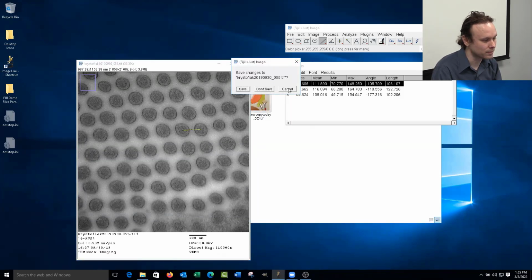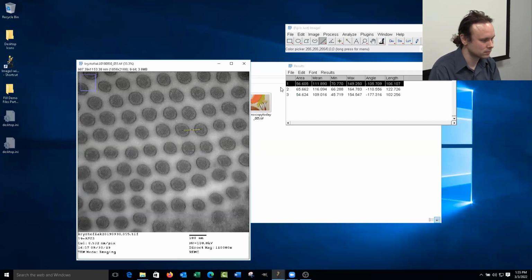Hey, Evan. Yes, if the scale is the same across different images in your data set, then when you draw the line in different images in your data set, it'll be the same scale and you can directly compare. So if you have the scale set correctly in each one, you can directly compare. And that's a very common thing to do. Okay, thank you.